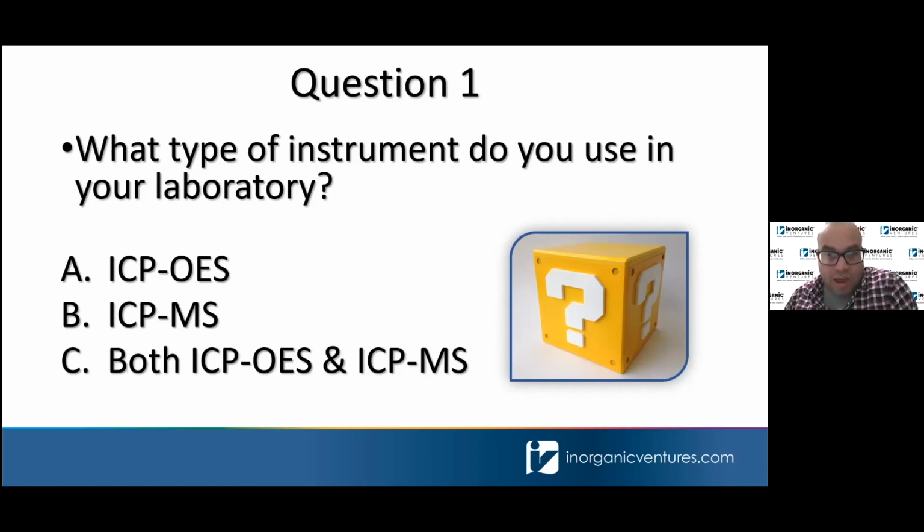All right, so it's pretty standard across the board. It's about a third of you are using both. That's interesting, okay. And it's split, the other ones are between mass spec and OES, so that's good to know. All right, so go ahead and go to the next slide.